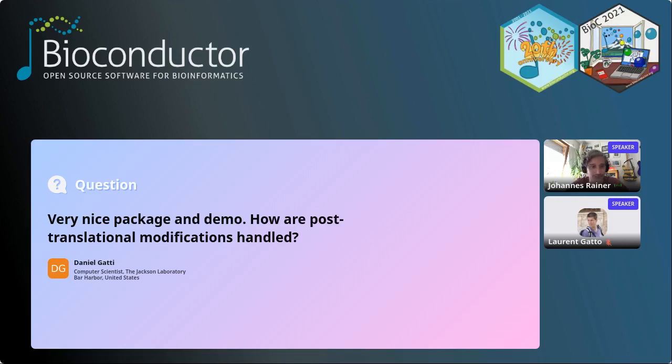Thanks. Post-translational modifications, Laurent. I'm not working in proteomics, so I'm not sure that Spectra can do anything with post-translational modifications. In terms of PTMs, they wouldn't be identified.